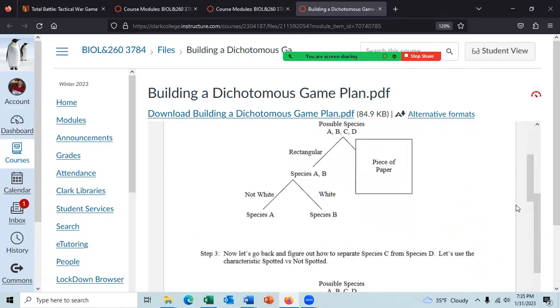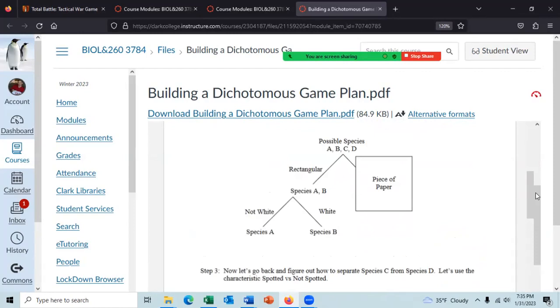So when you said that you were going to run 3 tests, we can't run any tests until you do those 3. Is that right? That's correct. You can't run any tests until I run those 3. And when I'm doing those 3, I'm going to set up the gelatin hydrolysis first. That will take a week to run.